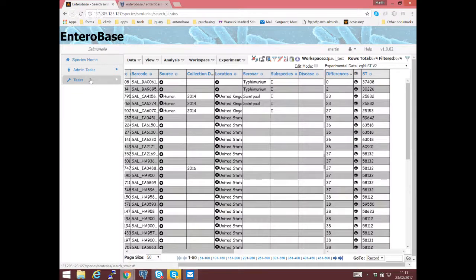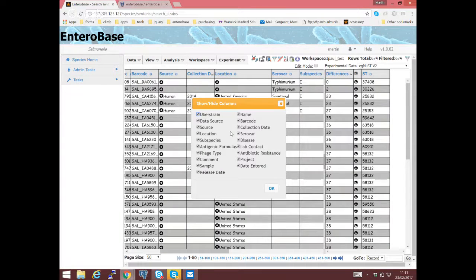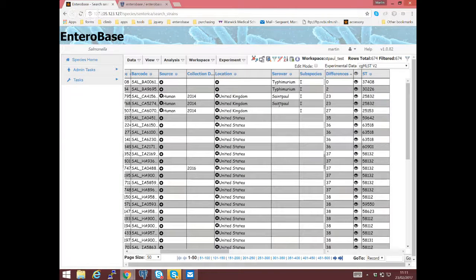And actually, when you save the workspace or resave it, it will memorize these settings as well. It will also memorize the column widths, and also if you show or hide any columns, this will all be memorized. So when you load the workspace, it'll be exactly as you left it. I'm not going to save this particular layout because people will get annoyed.